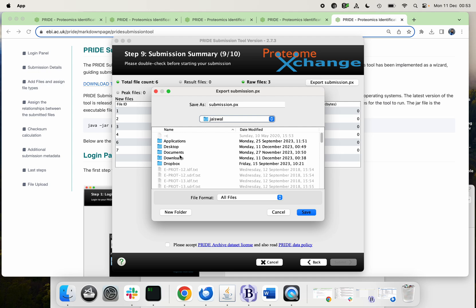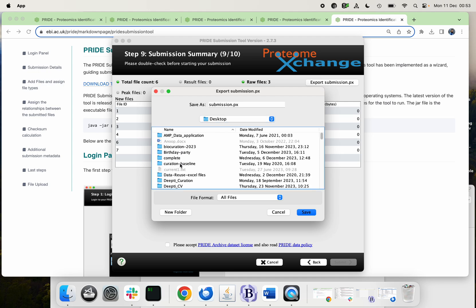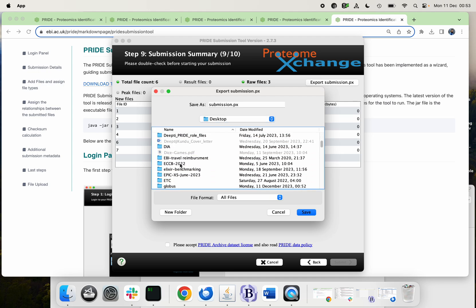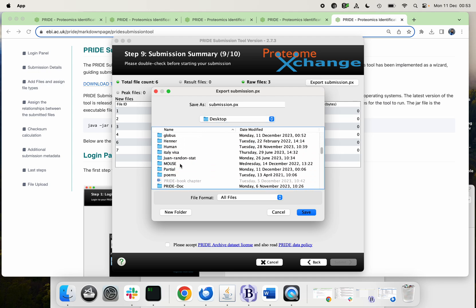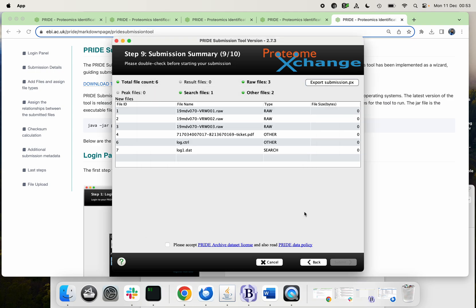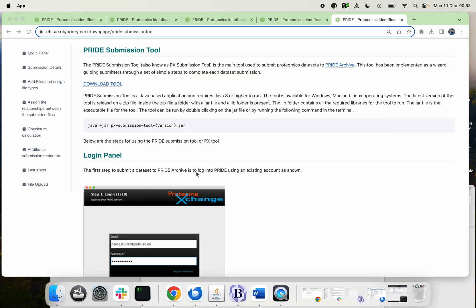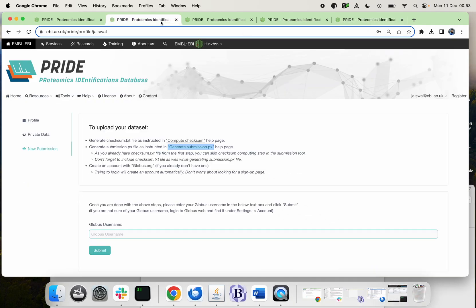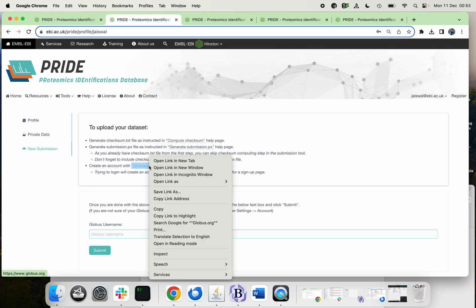Save, and then you can close your submission PX tool. Now you need to come back again to your account and click here.